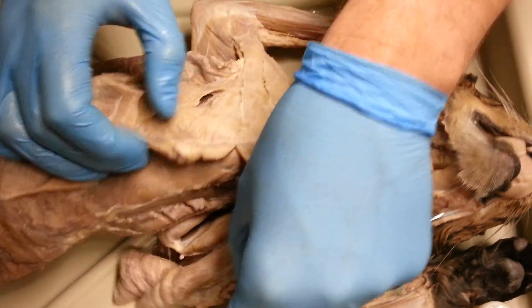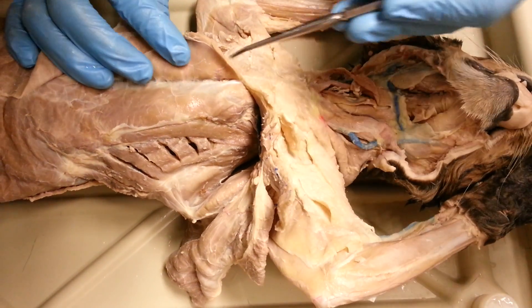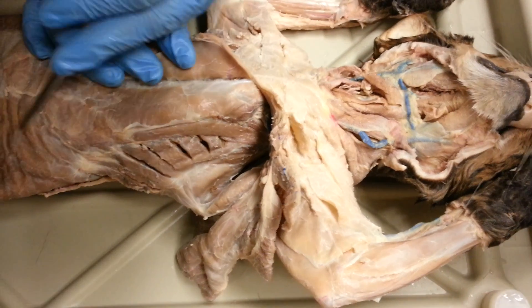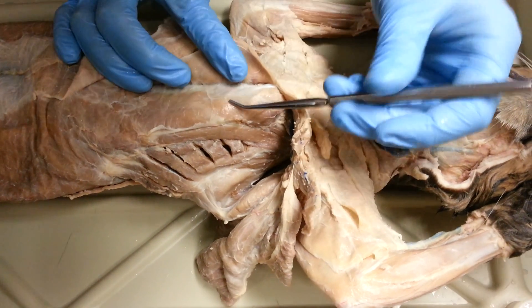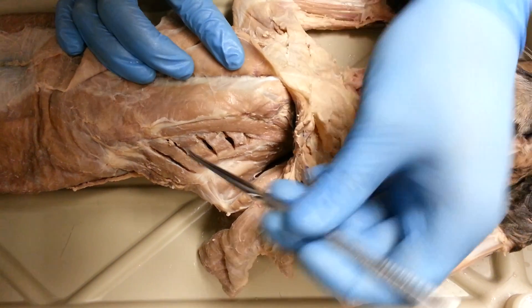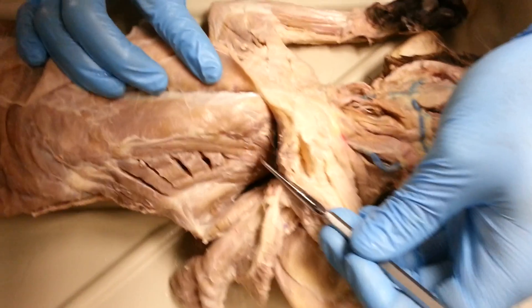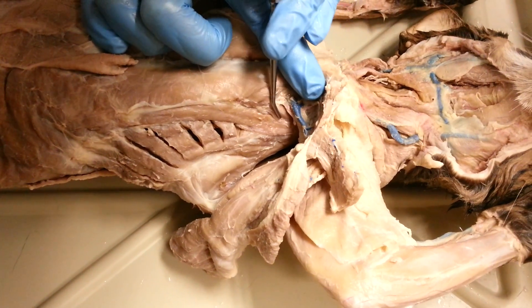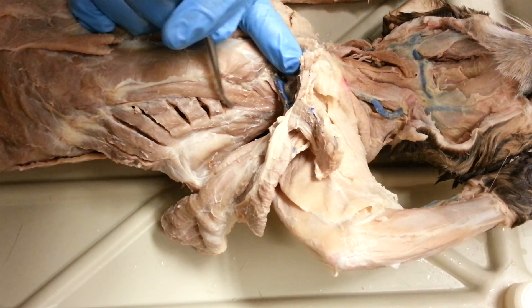Let's take a look at some of the deep lower body muscles. There's an easy way to see what we're looking at. This one right here, the external abdominal oblique, goes all the way up here to this one right here, which is the transverse costarum. Then we have this long one right here, which is scalenus medius. Then this one right here is scalenus anterior. And this one right here, which is a little tough to see, is scalenus posterior.